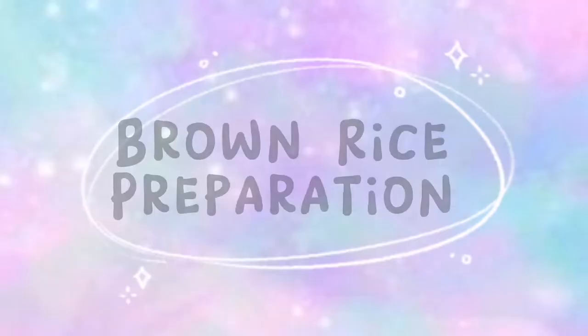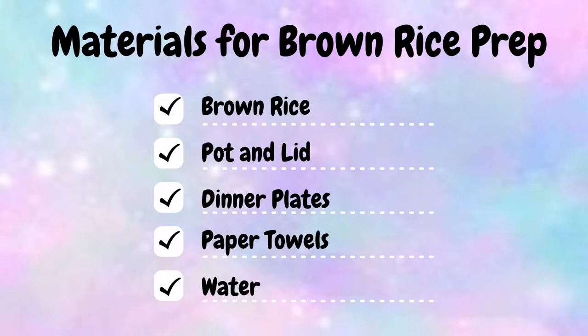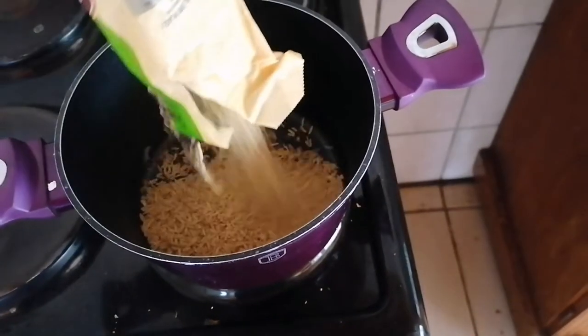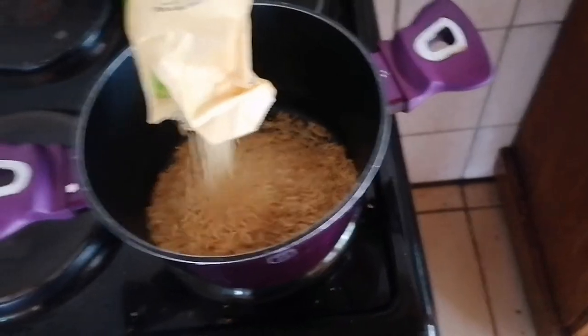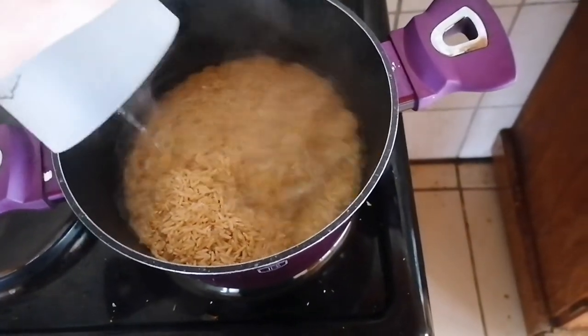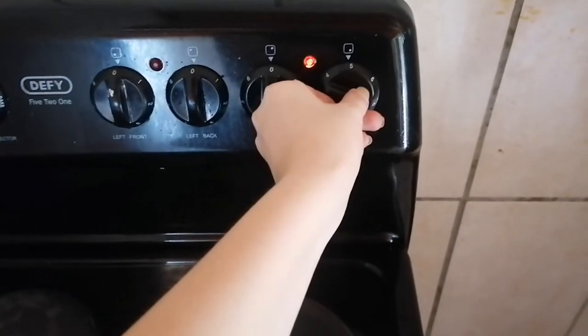First we need to prep our rice. To prepare our brown rice we need a few things: brown rice, a pot and a lid, dinner plates, paper towels, and water. The first step is to take a pot, fill it with however much rice you need, then add water so that there is about an inch of water above the rice. Turn it on and let it cook.